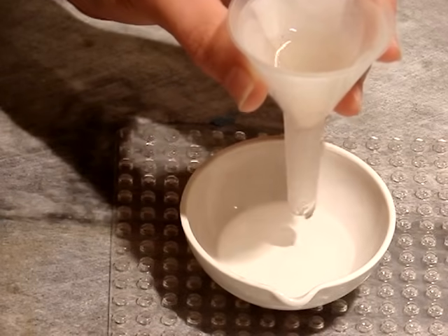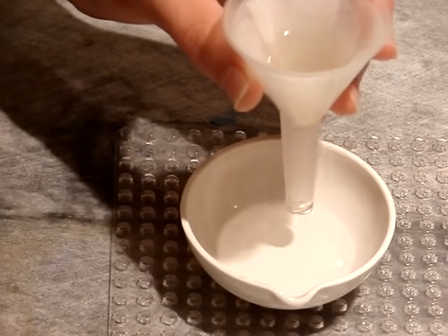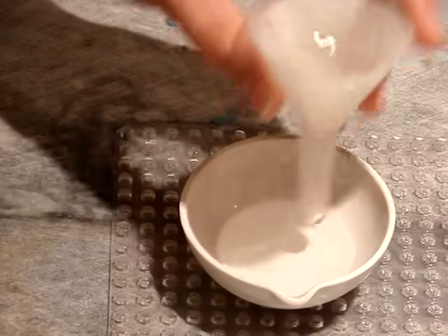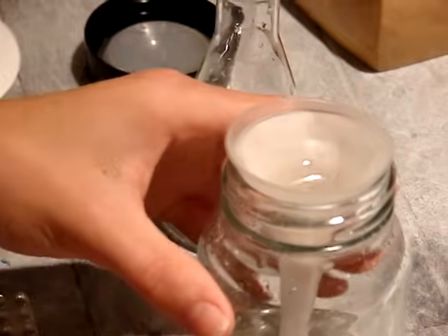So I think this is about good enough to dissolve. It's not much, but I don't have that much time. And meanwhile, I'll just set this over here so that we can see the sand left in the jar at the end.